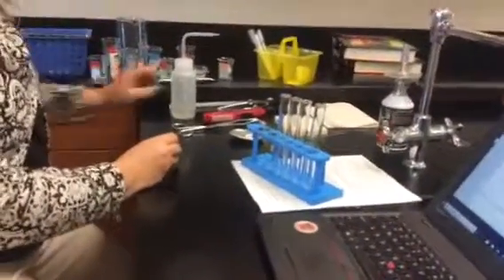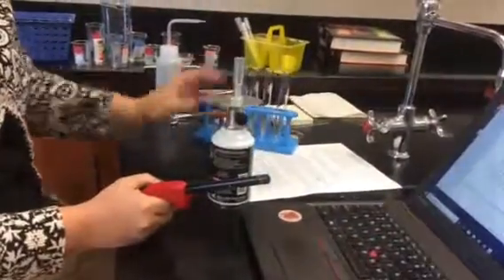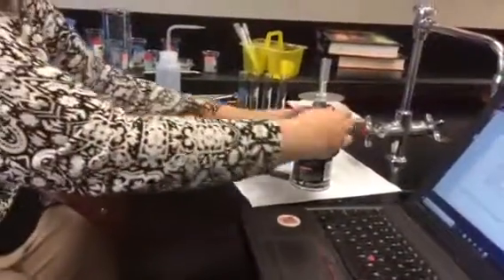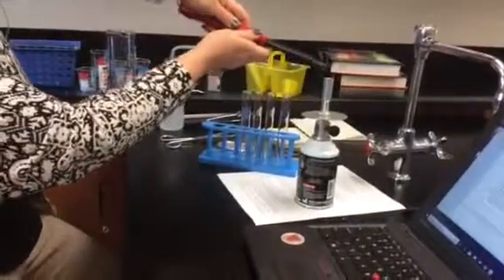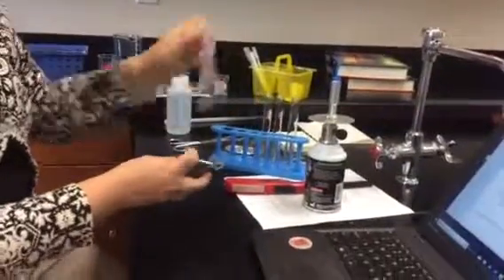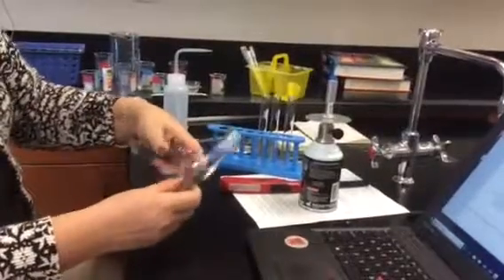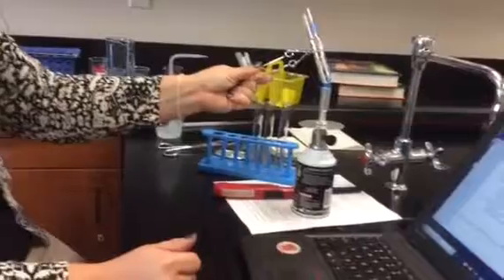And then it tells you to light it over the fire. In between each time we're using the fire, you're making sure to turn it off. So again, you wait for the hissing noise. Light it with your lighter. These are test tube tongs. So you're going to hold the test tube in here like this, and then you're going to heat the bottom of the test tube like that.